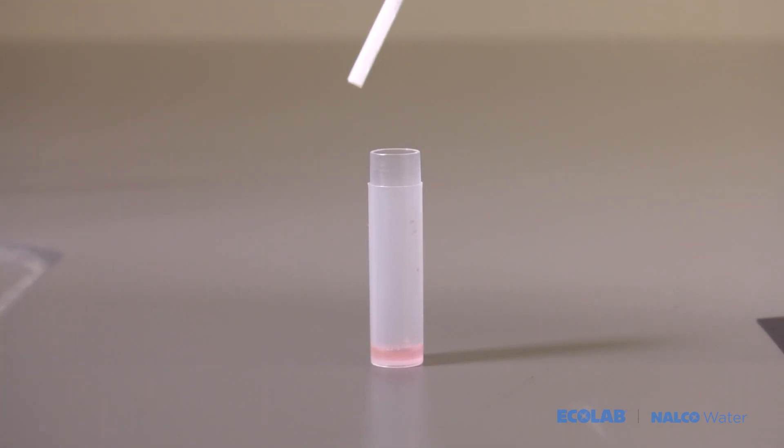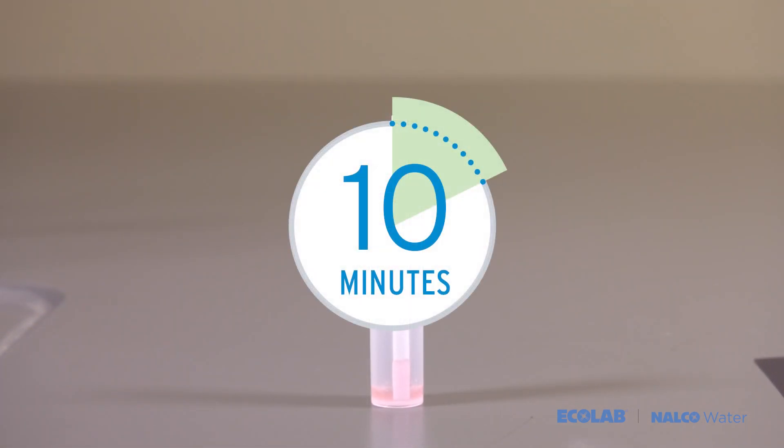Insert the test strip into the vial with the blue side pointing up. Leave the test strip in the vial for 10 minutes.